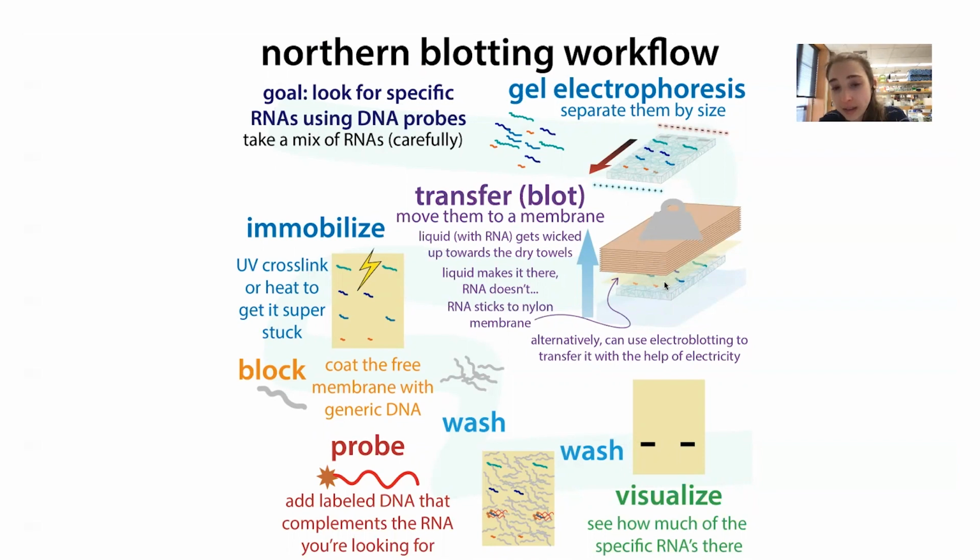The liquid is going to get wicked up, but your RNA or your DNA in a Southern blot is going to get trapped on the membrane. So it's not going to get to move all the way. It's going to get stuck on this membrane.